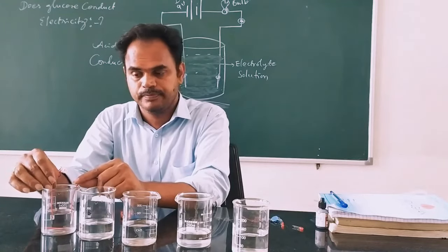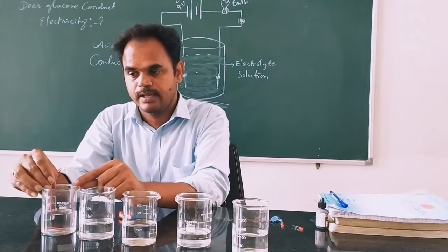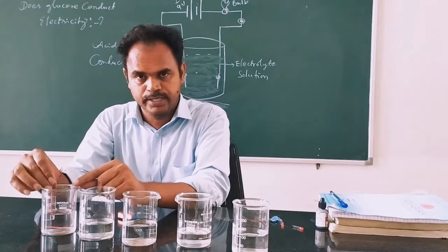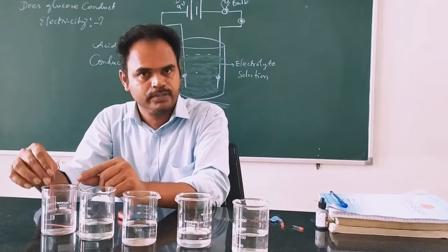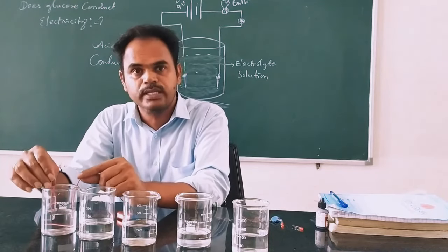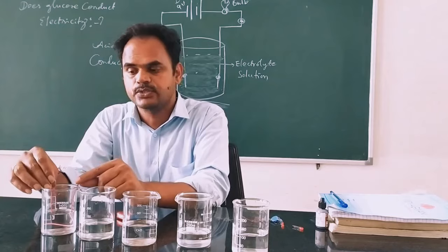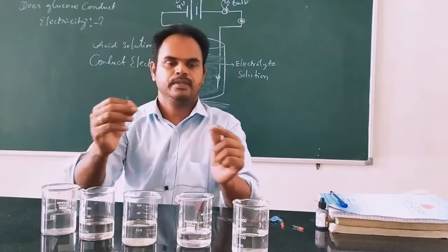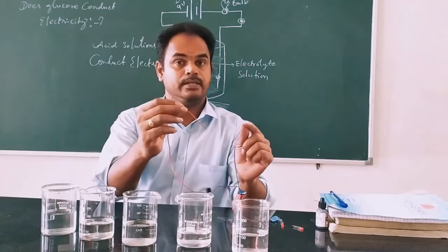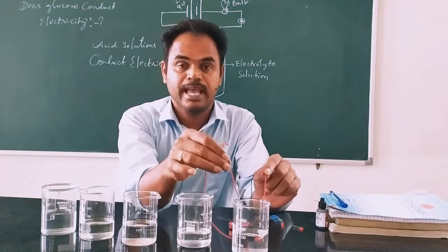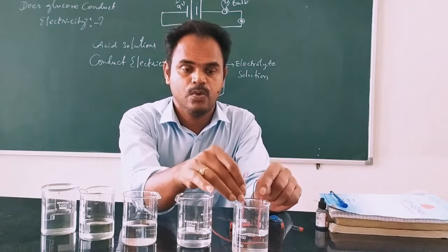With acetic acid: no sound, but the light is glowing. From this we can understand that acetic acid is a weak electrolyte. Now I have taken tap water — let us check.